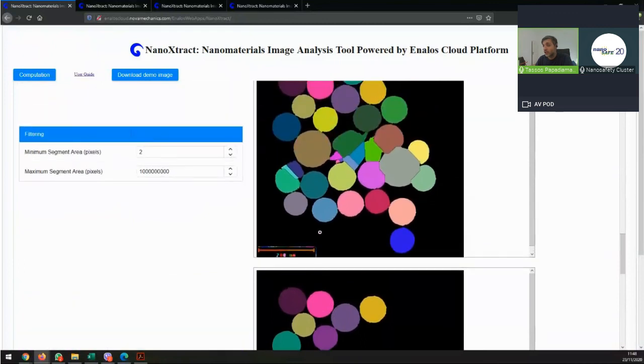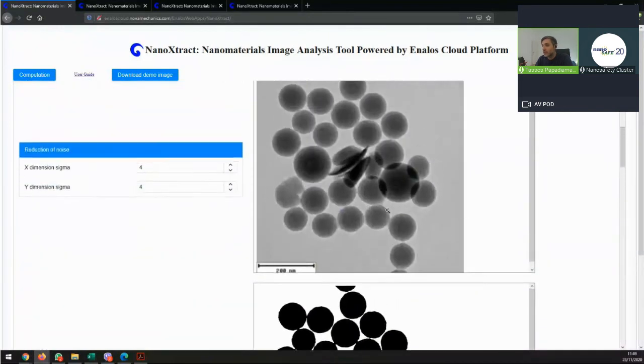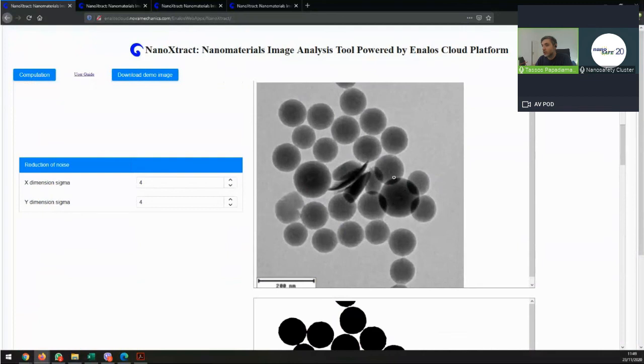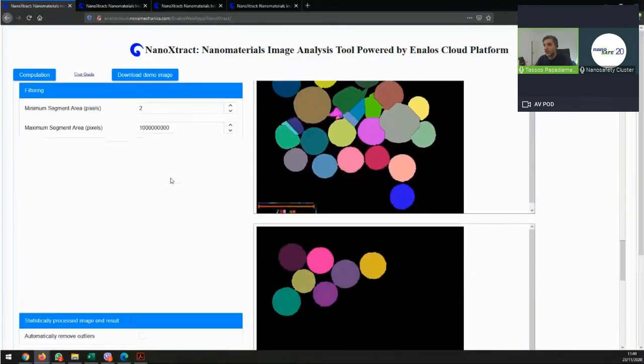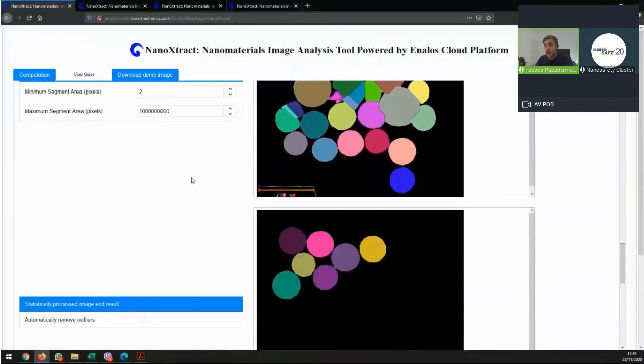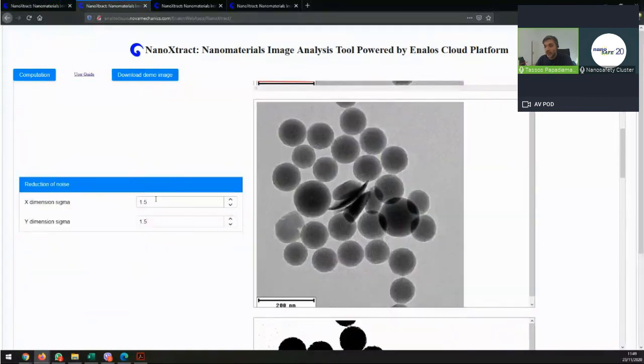You can more or less try and remove these parts here, and then keep, let's say, all the surrounding ones. You can see that it even identified, if you remember the image, this part here, although because of the difference in intensity it identifies different things. So we got a decent outcome. So I'm going to use the same values to run this one, where the scale bar is totally wrong.